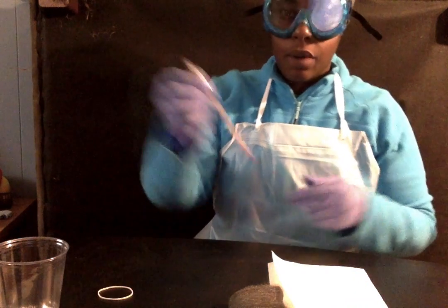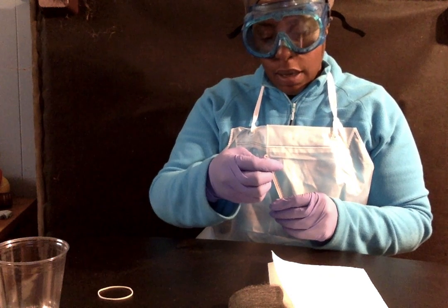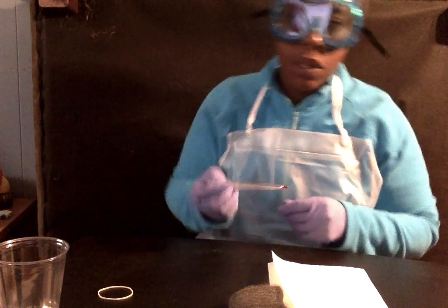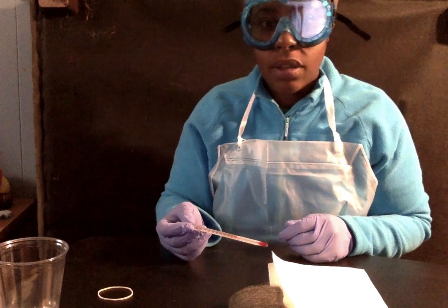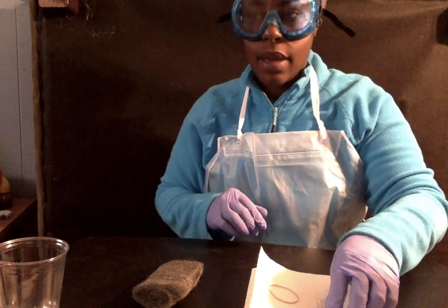So now we're going to measure the room temperature using the thermometer. And in here, it's actually about 30 degrees Celsius. So that information we would want to record in data table 1. We're going to place the thermometer and a rubber band on a paper towel. So as you can see, I've done that there.